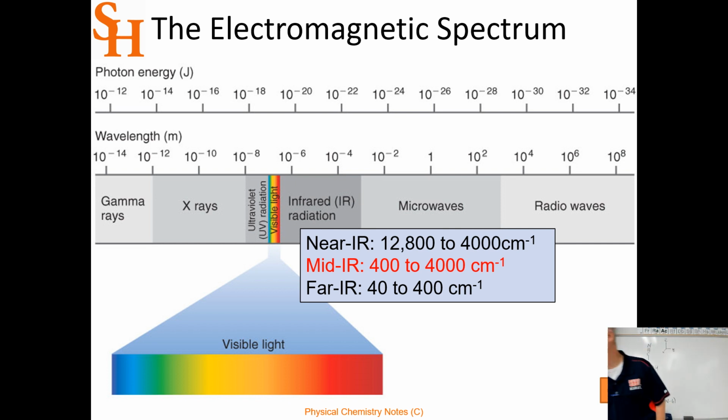They have 600 megahertz machines, pretty common at some universities. Then they have these mega NMRs at research facilities. So that's still in the radio frequency wave. It was kind of fun to watch. At UT, they had one that was 100 megahertz. That megahertz is the frequency that excites the proton.